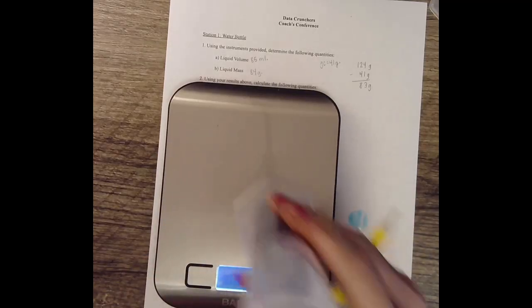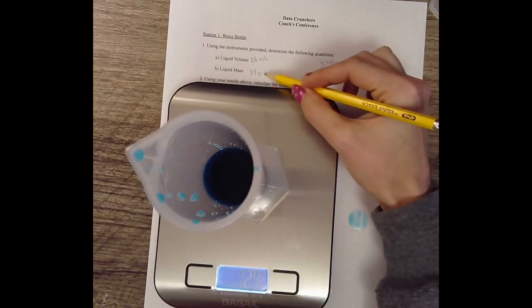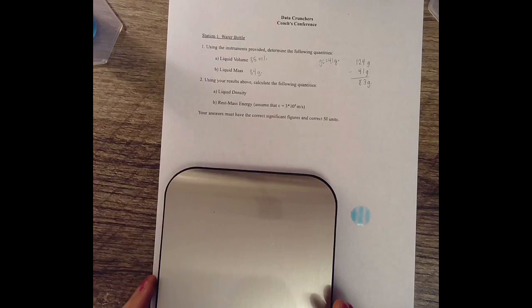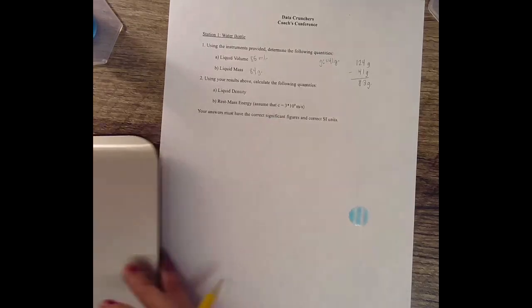Let's try this one more time. I'm just curious. 124. Alright, we're good. Everything works out. That might not be exactly accurate, but it should be in theory. Now you've measured the liquid volume and the liquid mass. And we'll play another video to show you number 2 about calculating your results.